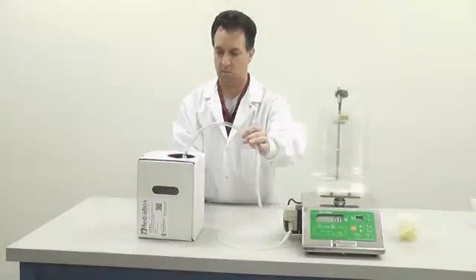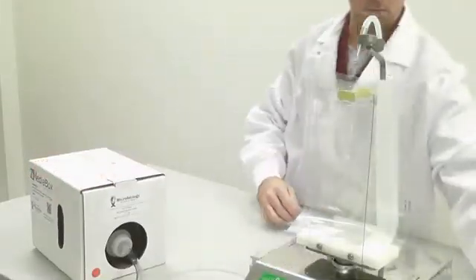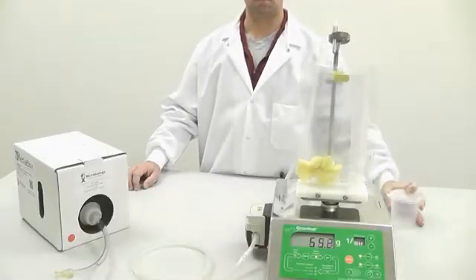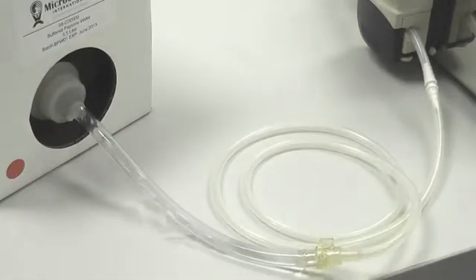For laboratories who make their own liquid media, MediaBox provides a reliable backup should an autoclave become inoperable or there is a shortage of personnel to make media. MediaBox provides a readily available source of fresh, sterile media with long shelf life, ready to use at a moment's notice.